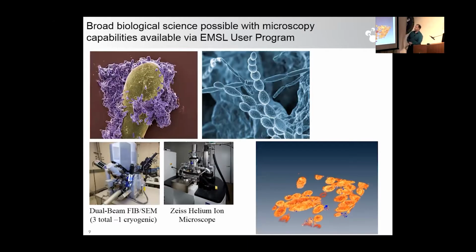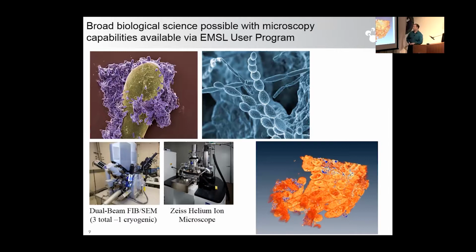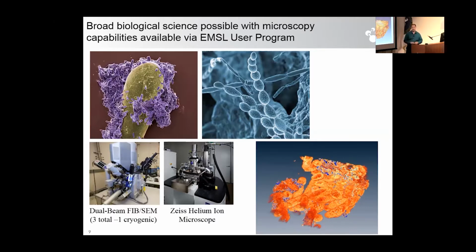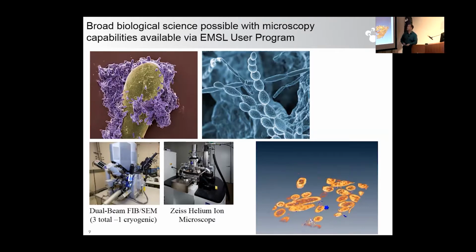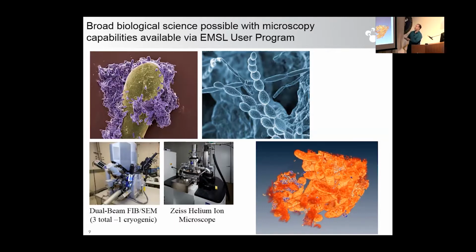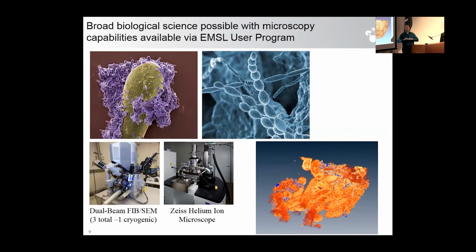Well, we have a number of techniques, and starting from the scale that Kirsten was just talking about, we have helium-ion microscopes up top that can take an image of your native isolate and start to look at bacteria communities as well as yeast structures. And here, if this was an SEM image, you would have out-of-focus blur above and below. But because this utilizes helium ions, you wind up being able to image a very large structure, and everything looks all in focus and has a 3D appearance to it, even though it's 2D. Very useful.